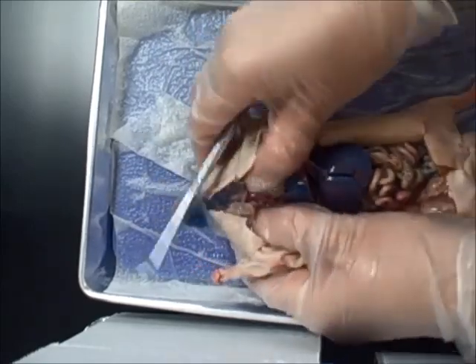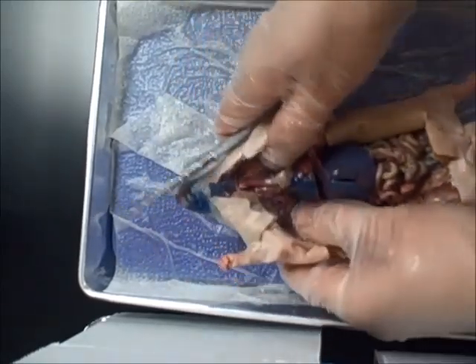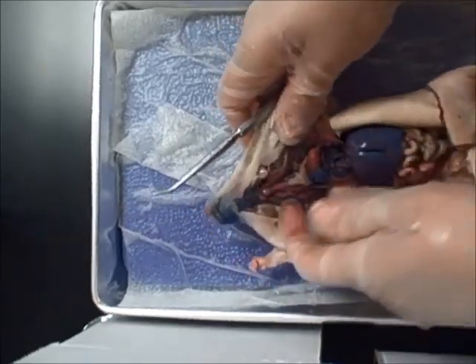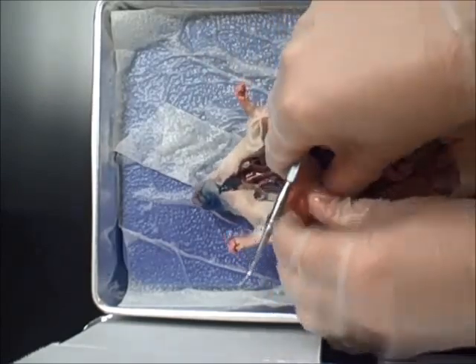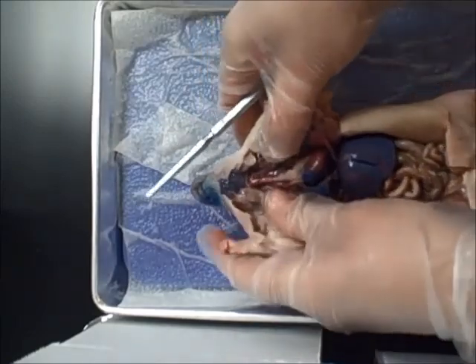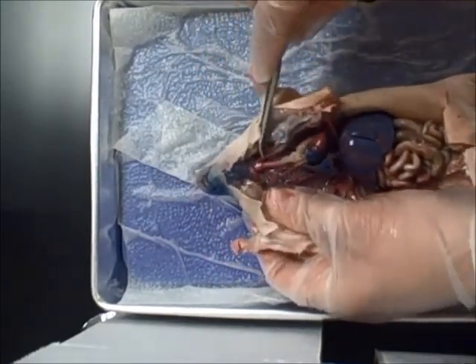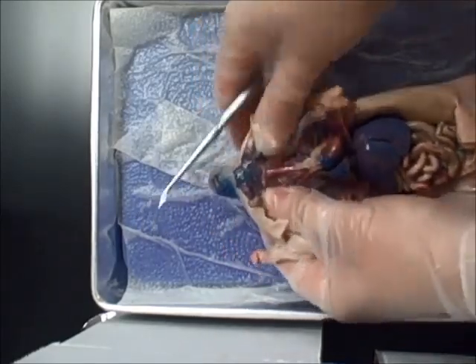So as you look into the thoracic cavity, you can see the heart and lungs. Heart and lungs are just anterior to the diaphragm. Once again, the diaphragm, that thin sheet of muscle that regulates respiratory or breathing. We've got the trachea here. Trachea has rings of cartilage to keep it open so that suffocation does not occur.